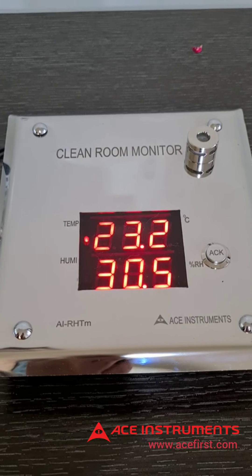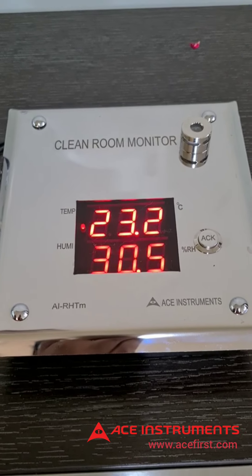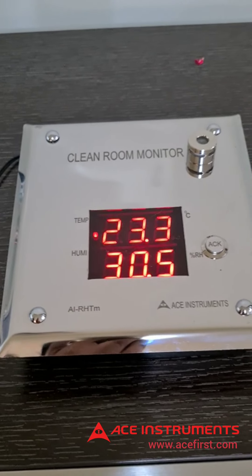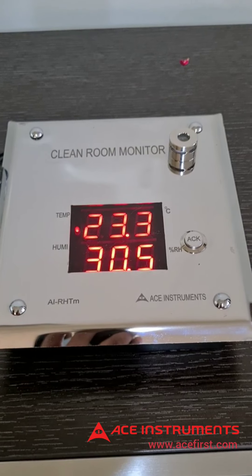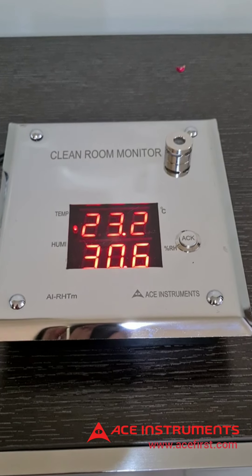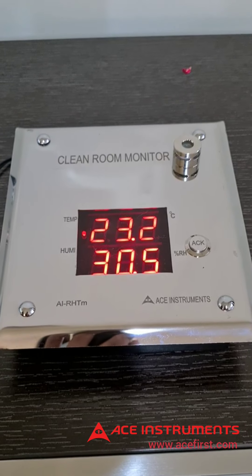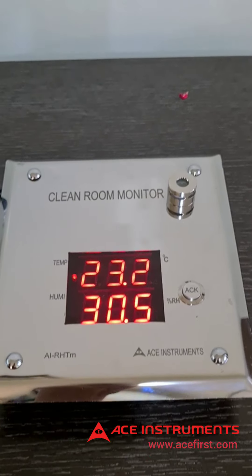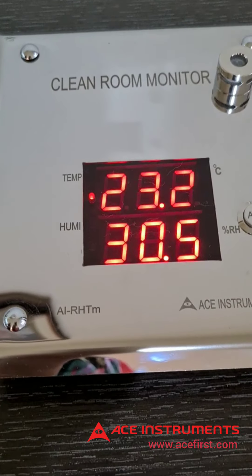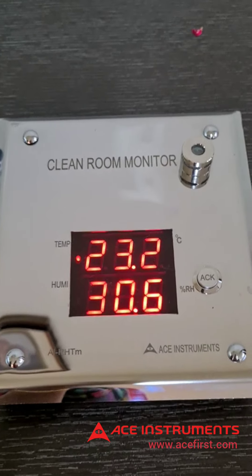Also available as an option is the RS485 Modbus communication port, which enables the instrument to be connected to a BMS, EMS, or SCADA system directly. The RS485 Modbus communication has programmable IDs and programmable baud rates. You may reach us for any application or customization requests at www.acefirst.com or call us at India time on 98490-776-00.